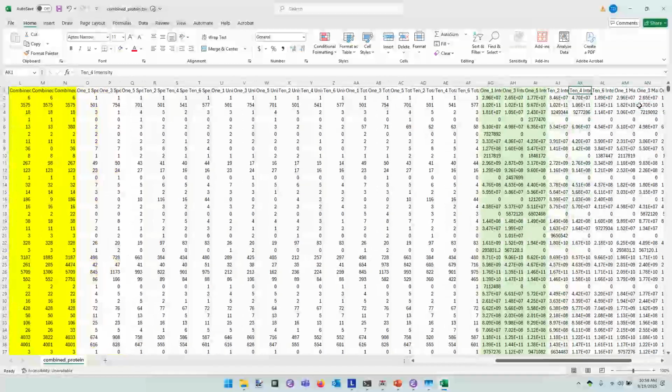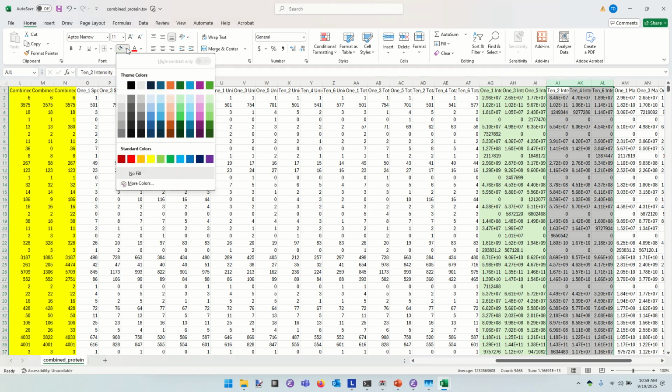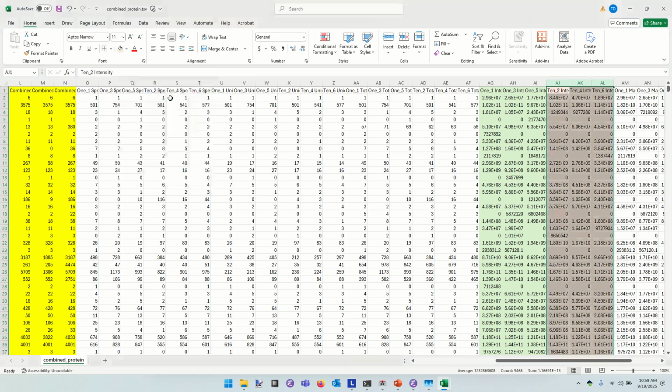Thank you. All right, so I'm going to color these columns specially because we care about them. Remember that at base, we wanted to know which proteins are different between our 2 cohorts. So proteins are rows here, and these columns represent the intensities seen for these proteins.